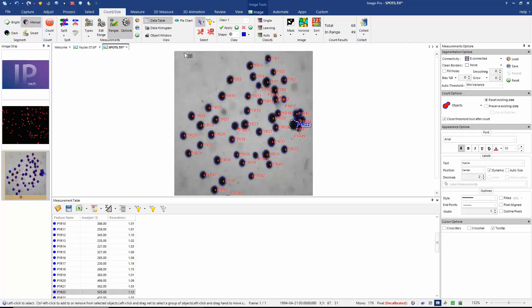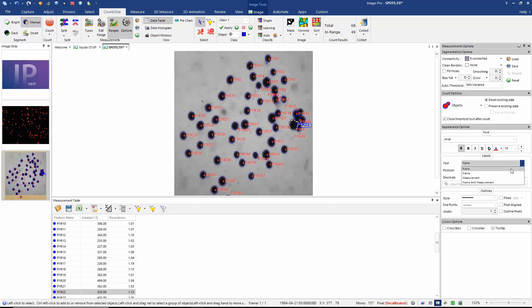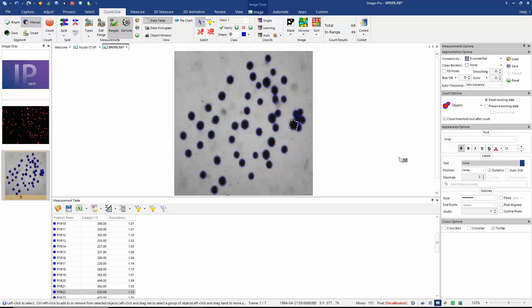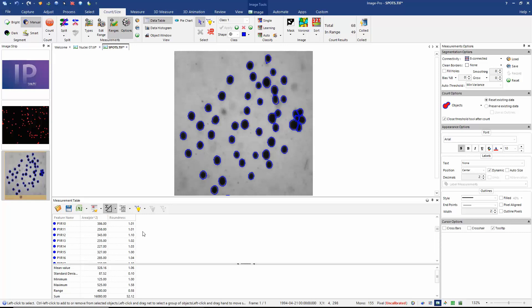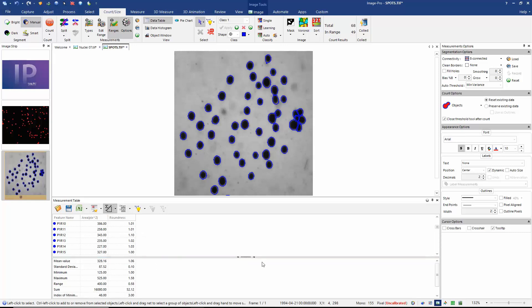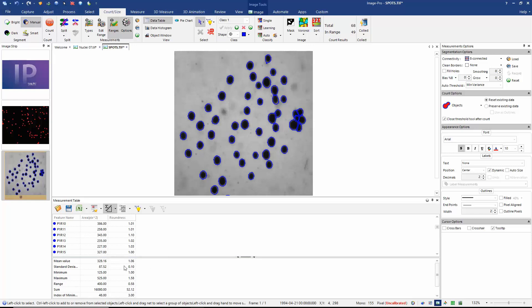OK, I'm just going to change my measurement options slightly. So let's remove the name of the object from the image, perhaps slightly increase the width of the line. And there I have all of my measured objects. If I look in the measurements table at my summary, we can see that we have a total of 49 objects in the image. And we also have a value for their mean area and mean roundness.